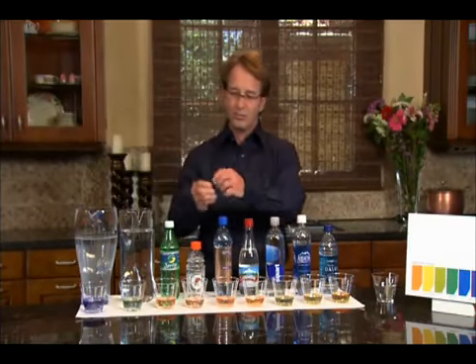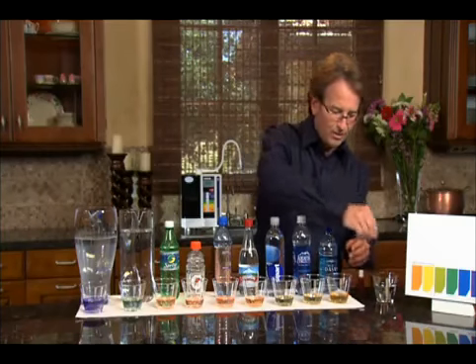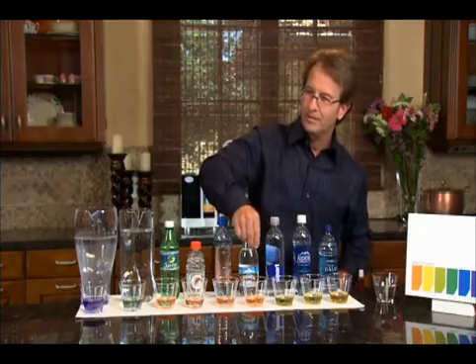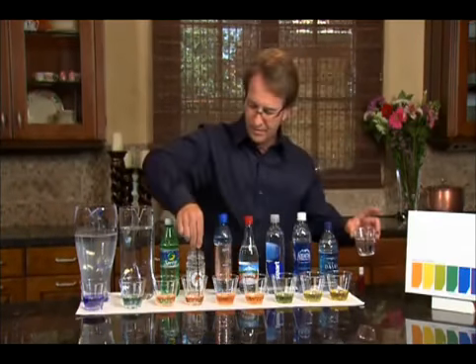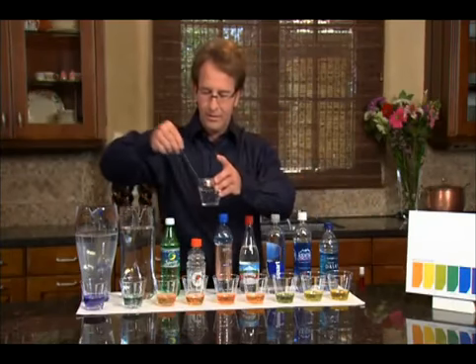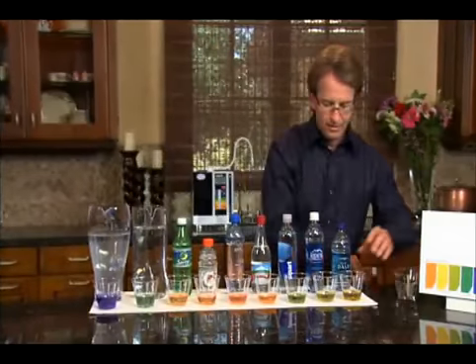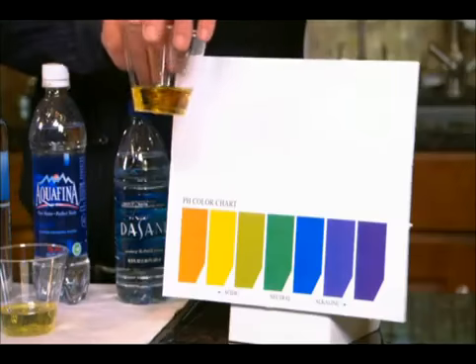We have a nice little pretty colorful display today, right? We'll stir these up real quick so you can get a better look, and then I'll show each one of them. Let's clean that off each time. Okay, so let's start here with the Dasani water, and we'll use this pH chart here and show.